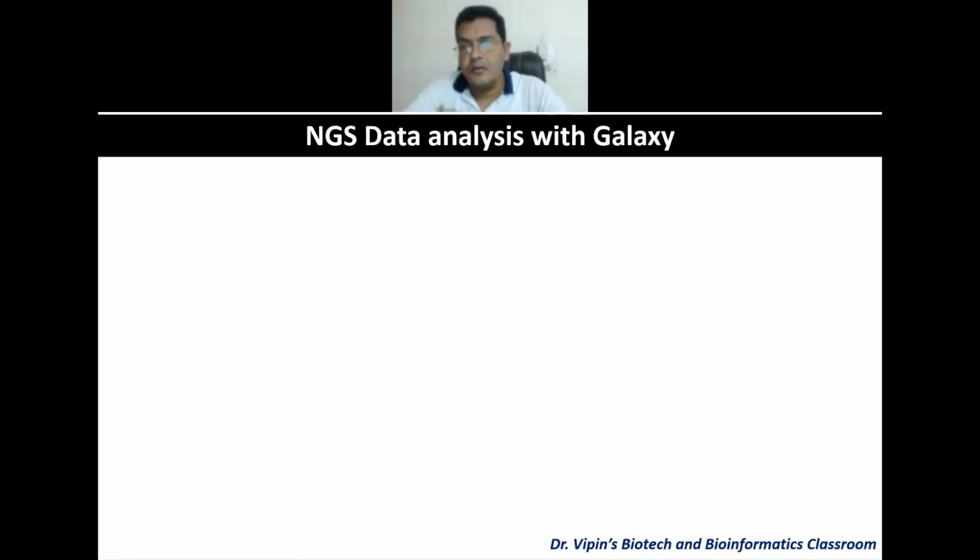So that happens. I told you there is a lot of queuing that happens in Galaxy. So it takes a lot of time to actually proceed from one step to the next step. Sometimes, depending on how busy the server is, what is the condition of the server, sometimes it takes up a lot of time. So did you not submit the next job, or you just got stuck? Sir, I got an error. Okay, there must be some problem with the input. We'll come to it and we'll see. Yes, sir. Thank you. So here we are.